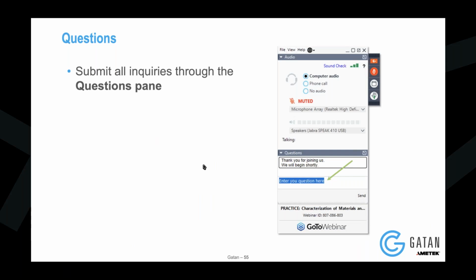In general, the results are going to depend a little bit on your sample and the way in which you took the data. All of them should yield phase retrieval results. If you're getting something very specific for just one reconstruction one time, that's very suspicious, so I would definitely think about checking your reconstruction parameters.